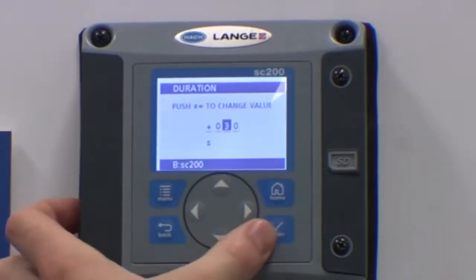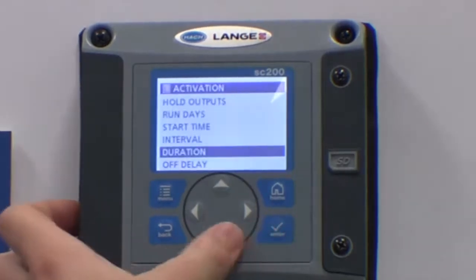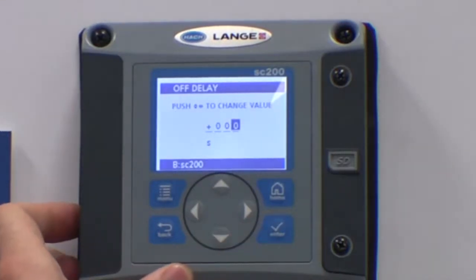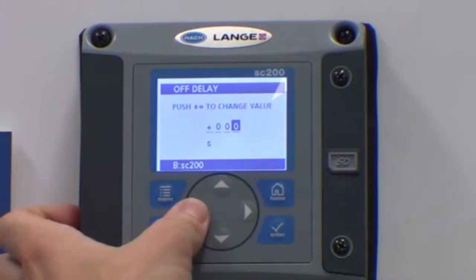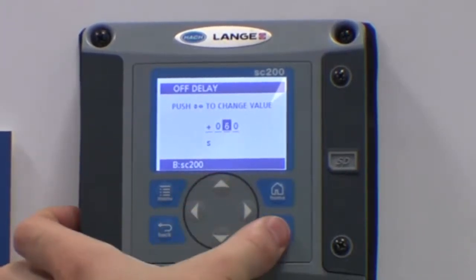The duration is the duration of the air blast — here, 30 seconds is a common time. The off delay is the delay that the outputs are held for after the air cleaning has finished. Here, we would recommend at least a minute for the readings to stabilise.